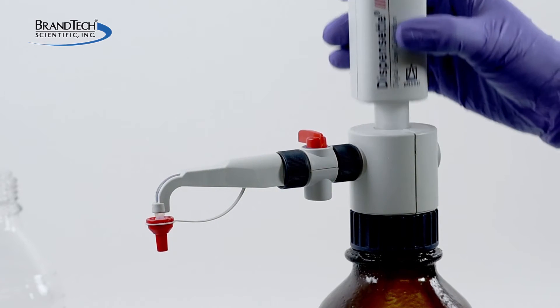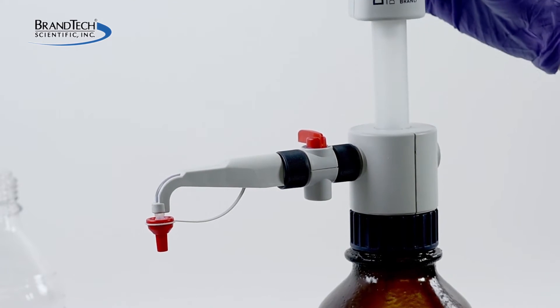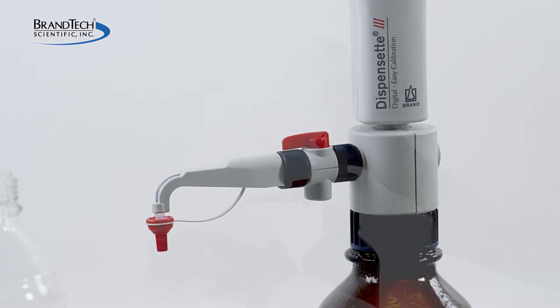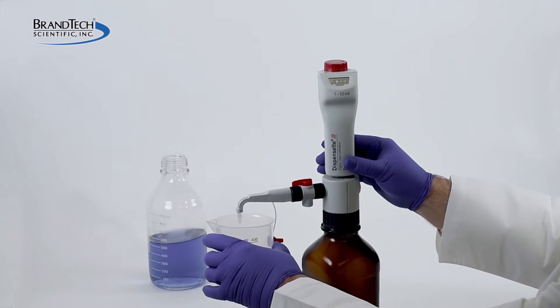If the instrument has a safety prime valve, turn to recirculate to flush remaining reagent from the dispenser. Then turn the valve to dispense and purge the remaining reagent from the discharge tube into a container.